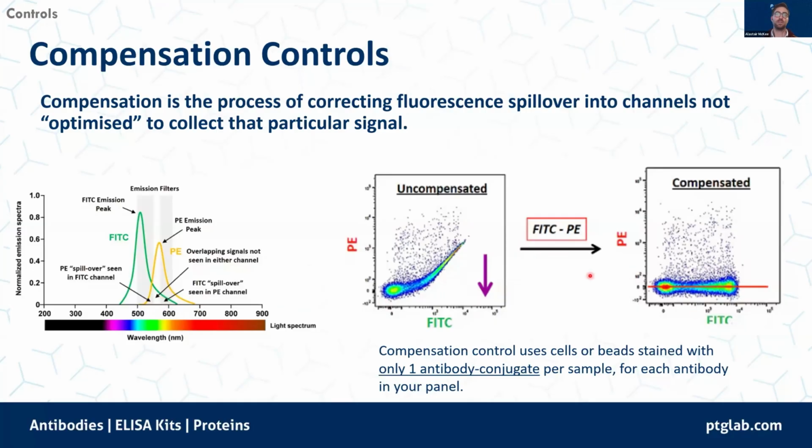And so this is what we would be doing for each fluorophore within our panel. So if you have 10 fluorophores, you'll be doing this for each of those one at a time.